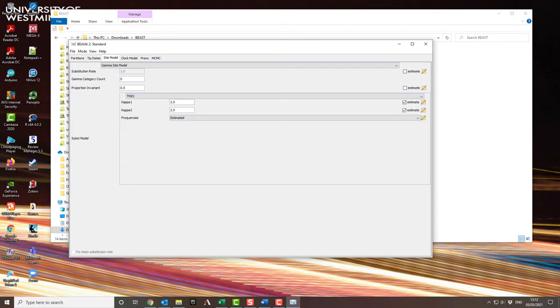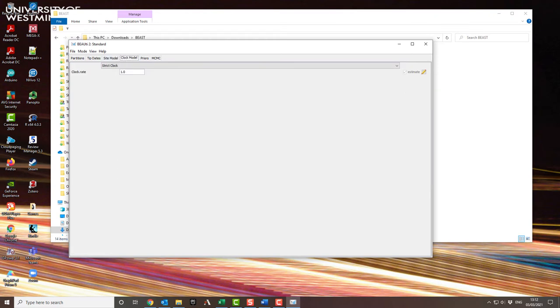If you pick Tamura-Nei, you've got a two-parameter model. So the parameters are called Kappa1 and Kappa2. Leave them as the default because the program will automatically find these. If you knew something about the distributions of purines and pyrimidines within your sequences, you could set it. After that, you need to pick the clock model.